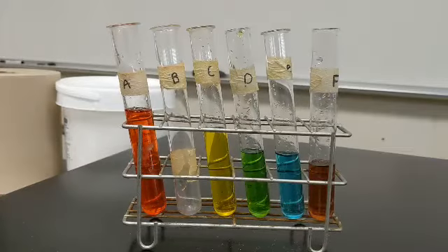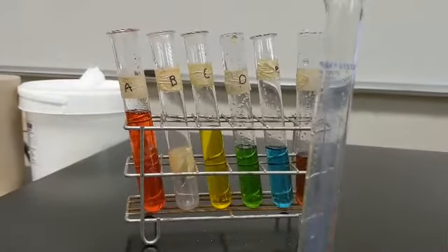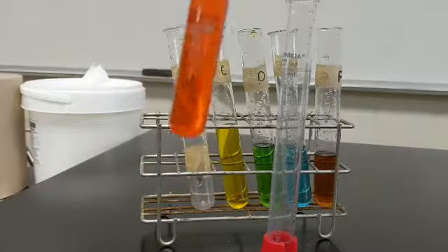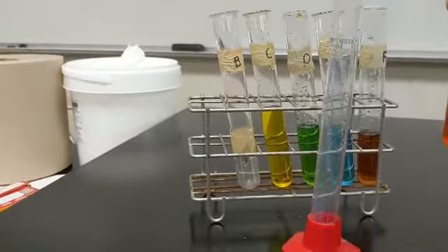Okay, step 8. From test tube A, take 8 milliliters of water and pour it into test tube B. I think you can see where we're going to go with test tube B. We're going to take some red, and that's not as red as it should be. This is a little more orange than red.